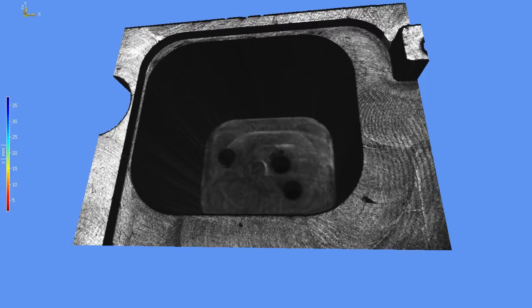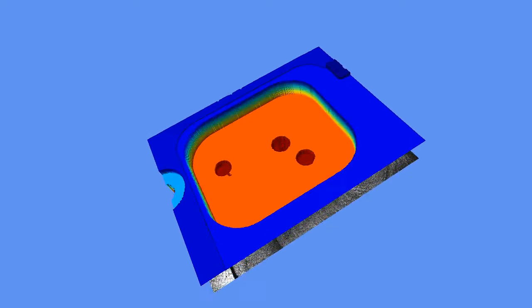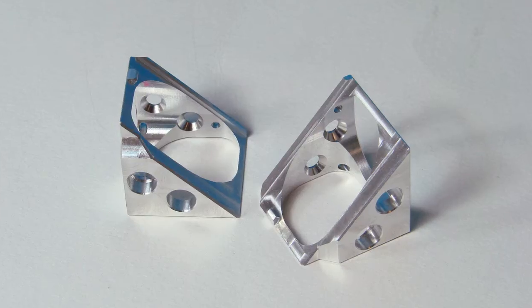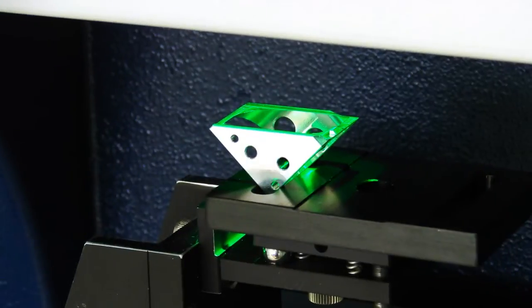Structures and surfaces can be examined quickly and checked for defects, textures and form parameters, as well as standardized parameters like flatness according to ISO 1101.